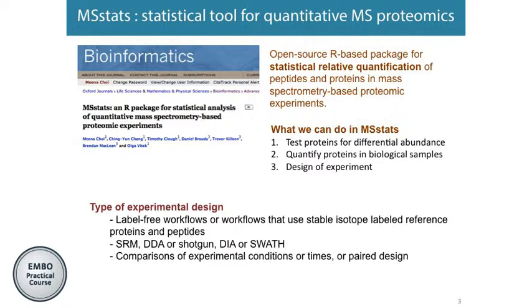people are quite interested in whether they can use SILAC data or iTRAQ data or TMT data. We are not ready yet, but we have started working on SILAC data, and we want to look at more PTM data. So we are going to give you more suggestions very soon, but we are not ready for iTRAQ data yet. But you can keep watching our new releases and new aspects on the MSstats web page, so you can see what is updated.